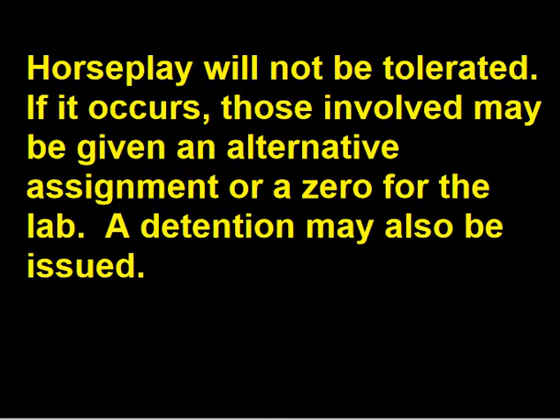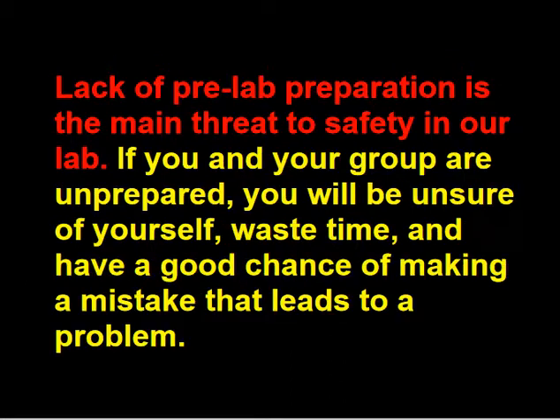Horseplay will not be tolerated. If it does occur, those involved may be given an alternative assignment or a 0 for that lab. A detention may also be issued. So lab safety is really serious in the classroom because we're going to be working with some pretty harsh chemicals this year. So it's really important to play it safe.